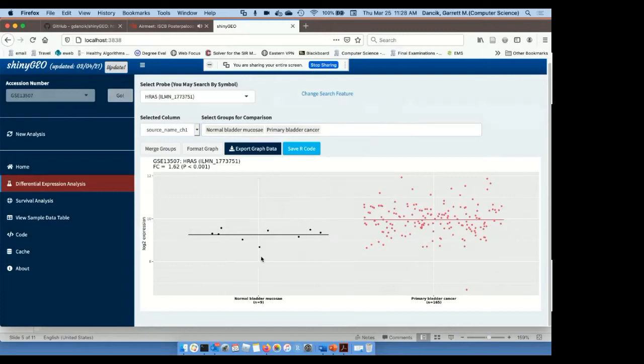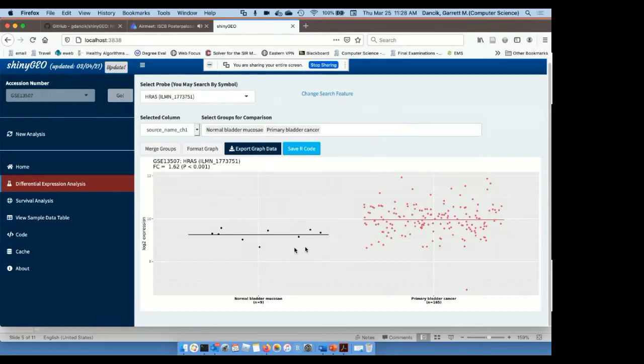And so now we have expression across the normal samples and the bladder cancer samples, and from the analysis, we can see that HRAS is upregulated in bladder cancer samples. The fold change is 1.62, and the p-value is less than 0.001.